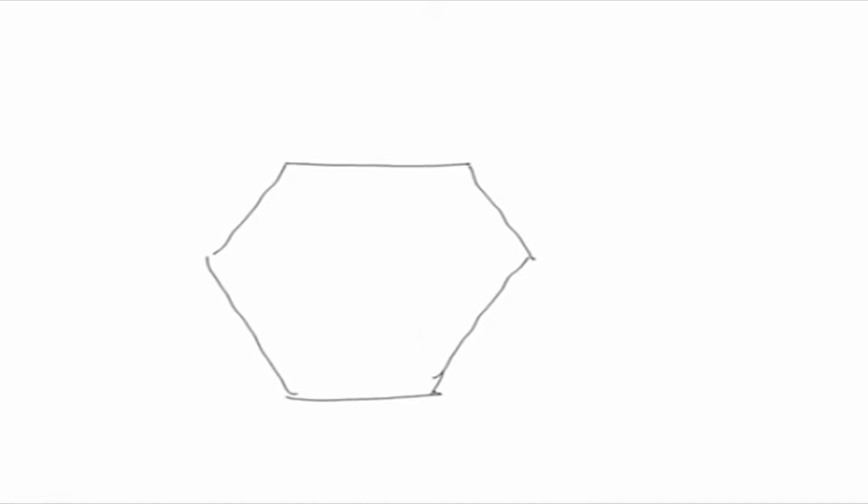Each leg of this hexagonal array contains 4 electrodes. So I will just make this one, and these are 4 electrodes. These electrodes are made of platinum wires.